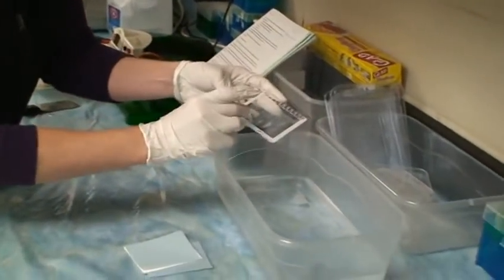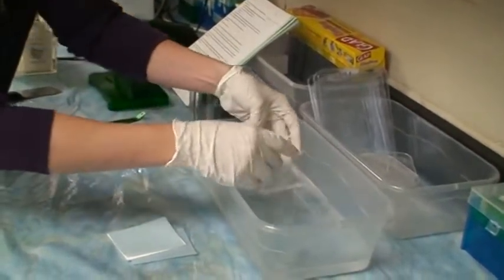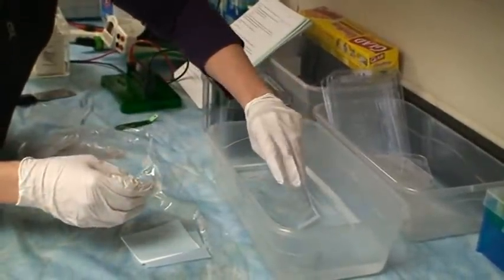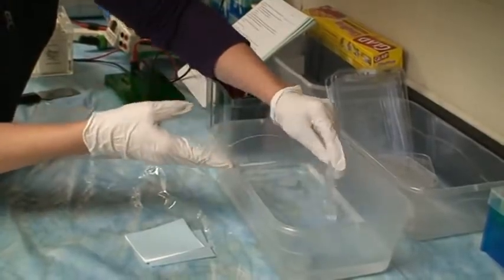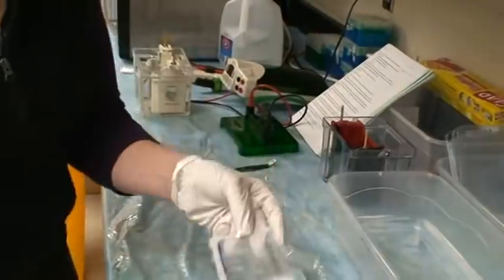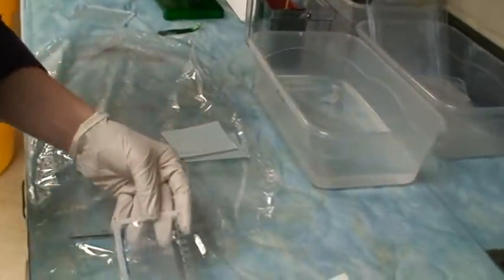You've got this dish of transfer buffer, and you can try to peel your gel off. It's probably easier to just lay your gel and the plate into the dish. Before you do that, you're going to want to make sure that you mark the orientation of your gel.